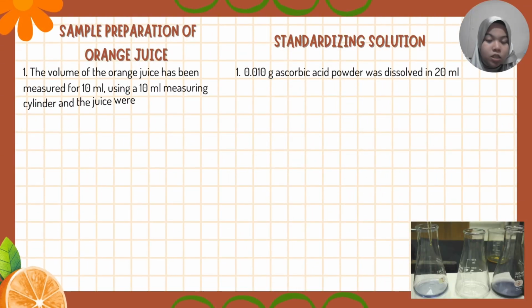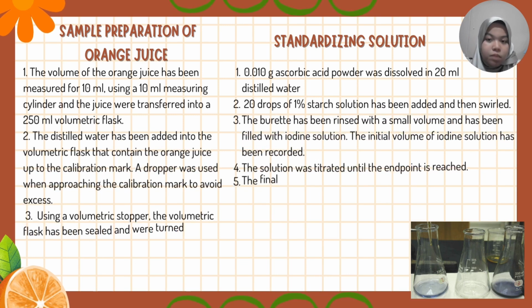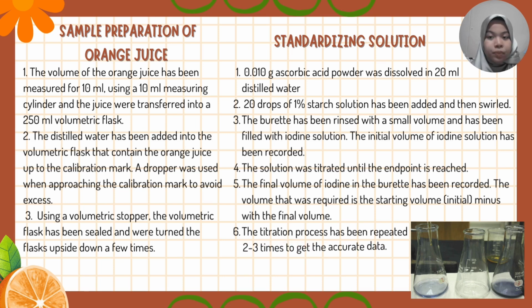Assalamualaikum and hi, my name is SYAIDATUL MARYSSA binti AKHIR, and for this video, I will explain the procedure and the results part. And now, I will explain the procedure for the sample preparation of orange juice.